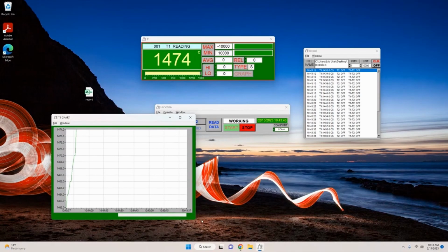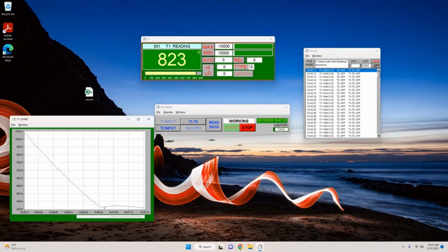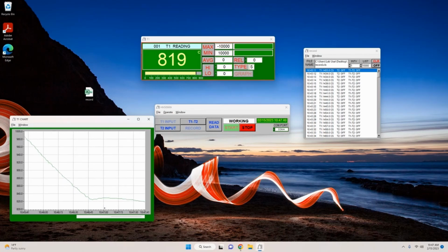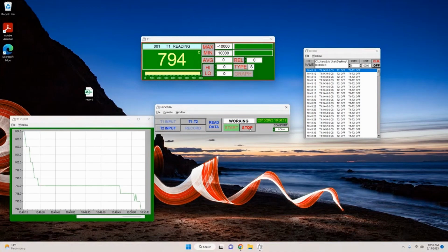When you remove the molten sample from the heater, you should begin to see a sudden drop in temperature. You'll be looking for a point on the graph where the temperature begins to level out. This means that phase transformation is taking place. I would recommend recording this value, but be sure to continue recording temperature data after this phase transformation takes place to ensure that this actually was the location where phase transformation took place and not just a small blip in temperature values. After recording sufficient data, select the stop option to stop data collection.